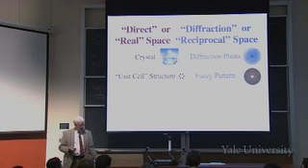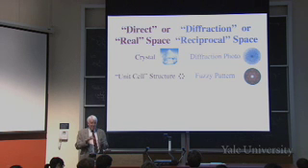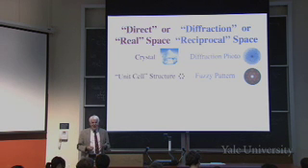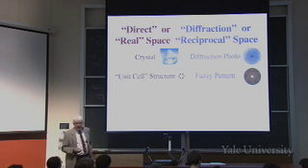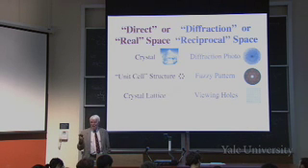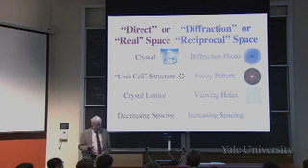So in real space, you have a unit cell structure, the pattern that then gets repeated to make the crystal. That pattern gives rise to this fuzzy pattern like a snowflake in reciprocal space. And then you have a crystal lattice, a regular repetition of these patterns, and that's like viewing through the holes in the pegboard.